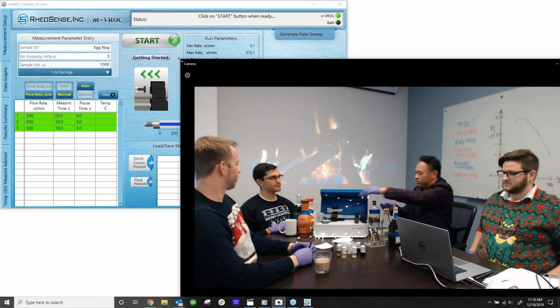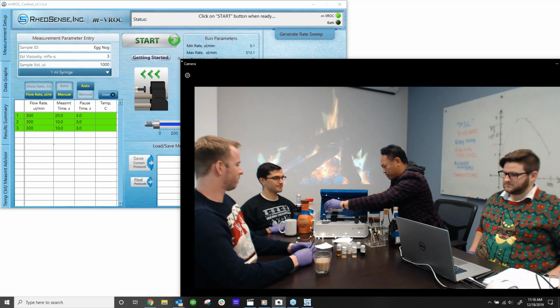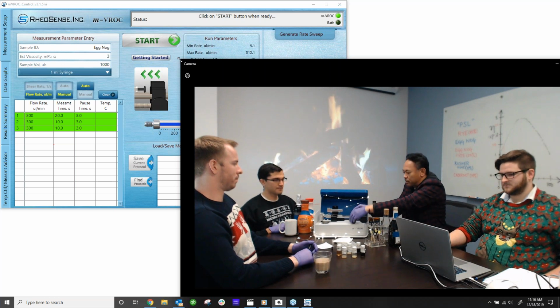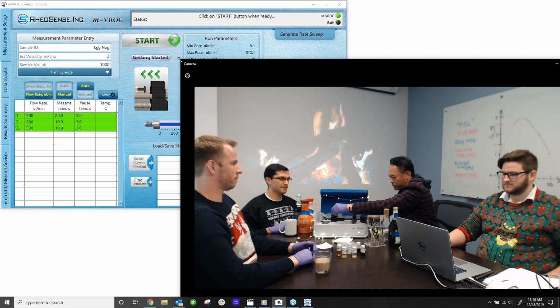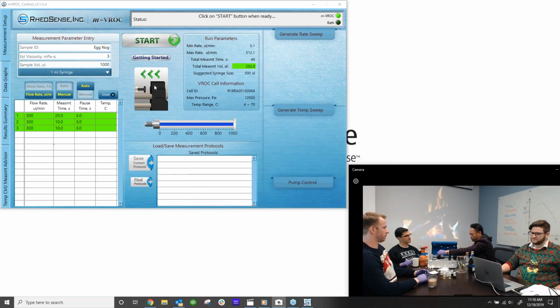And load this in. Move the pusher block. Open the valve. Close the syringe jacket. And we are ready to go.